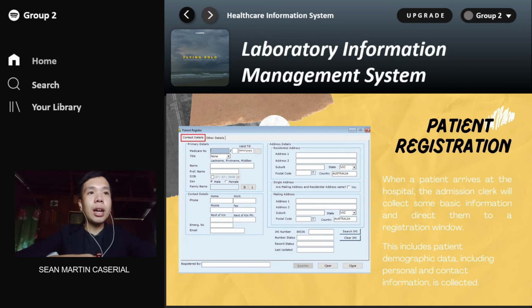So when a patient arrives at the hospital, the admission clerk will collect some basic information and direct them to a registration window. This includes the patient demographic data; the personal and contact information is collected. So upon entering the institution or the hospital, if you have the referral from your municipal hospital that advised you to be referred to a larger hospital where the facilities are complete, or you can undergo procedures there.